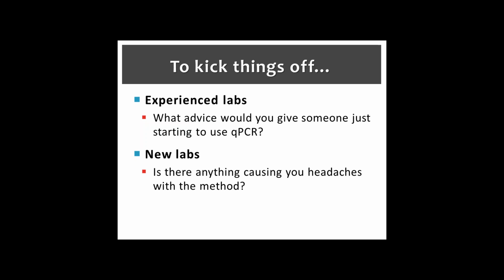Is this making any sense? Did I get in the right ballpark? And that's also what Qubit is for, right? Qubit helps you measure the DNA. Yeah, right. So do you guys know what a Qubit is? Similar to NanoDrop? Okay. Once you get through that, we're going to let you go.